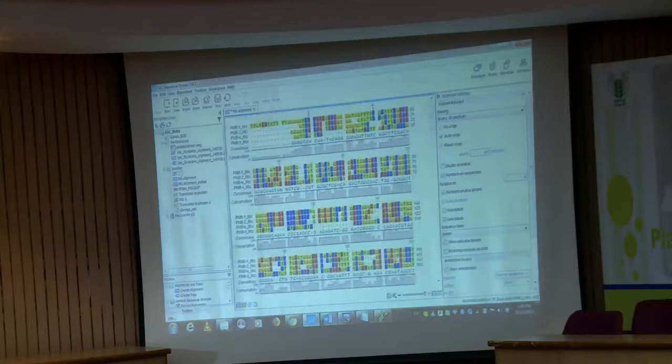So, I will just show you how to do it. Let us suppose, can you see this sequence, it started a bit early, but the other 3 sequences are starting at a later stage. So, it is missing around 8 to 10 bases from each, and others are also not similar. Because as I told you, at the beginning and end the data is compromised. So, we can trim that region to avoid any confusion about what that base is, because if I will be sequencing around 600 bases, I will consider that okay, at the end around 500 will be in my hand, I will chop off another 100 to 200 bases from both the ends.